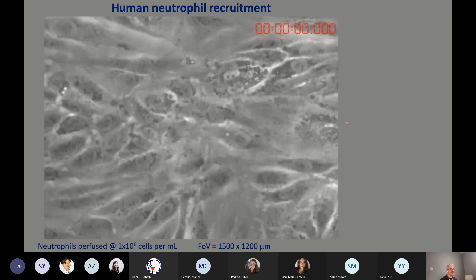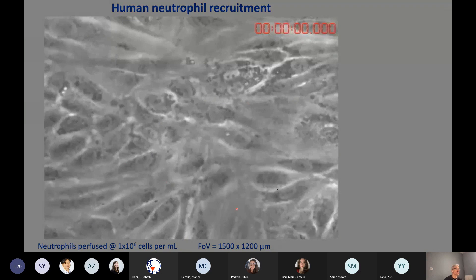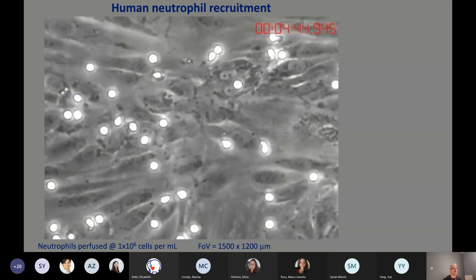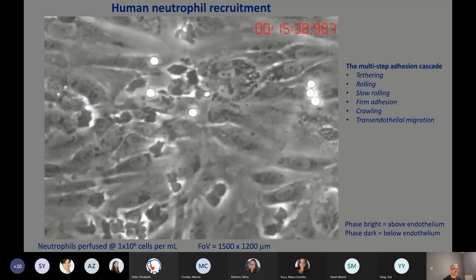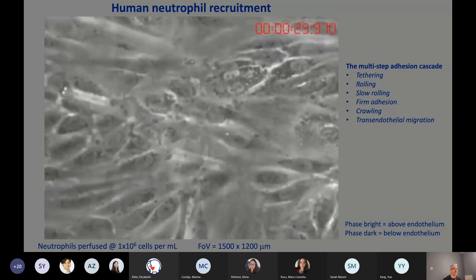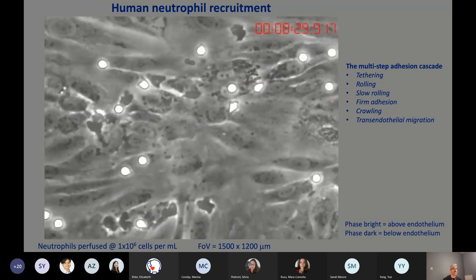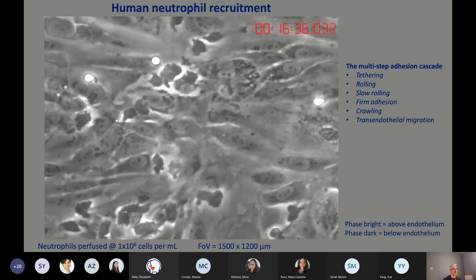This video is typically what we would see down the microscope. The field of view is about 1,500 microns by 1,200 microns, and we perfuse neutrophils at a density of 1 million cells per ml. Cell density is important — you don't want too many cells impacting your field of view, otherwise it's difficult to analyze cellular behavior. In this flow assay, various phases of the multi-step adhesion cascade are visible: cells crawling on top of the endothelium, cells undergoing tethering, rolling, slow rolling, and firm adhesion — all visualizable in a single video.